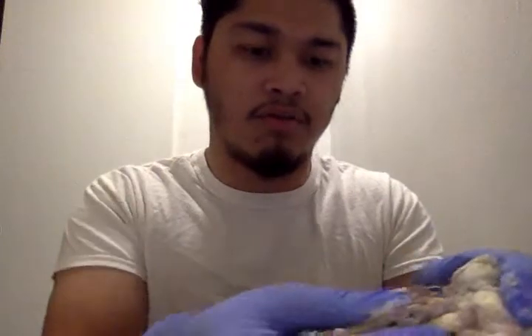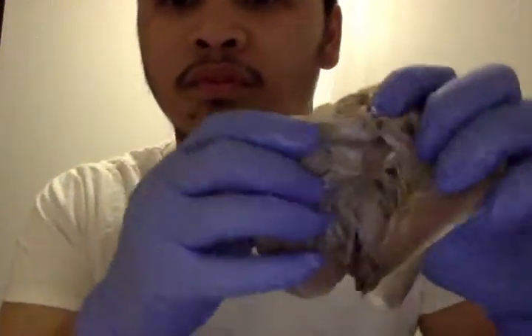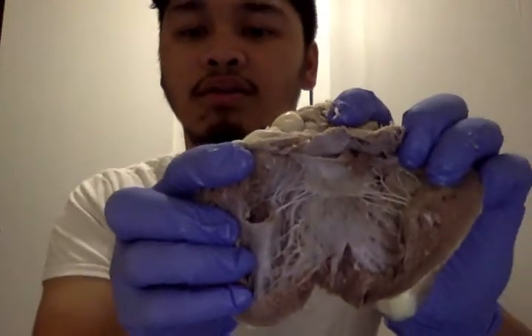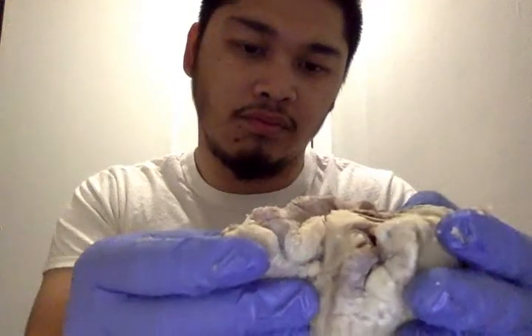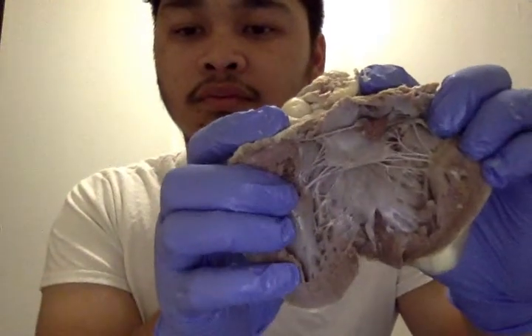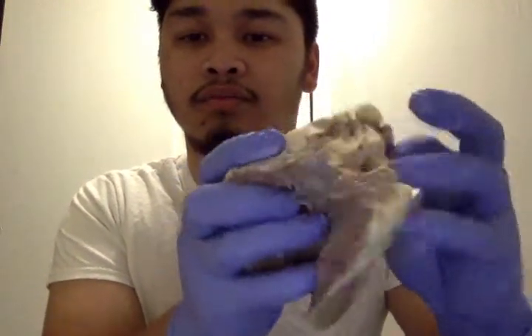There we go, that's better. I dissected the lateral view — that's the heart. And there's the bulbs.